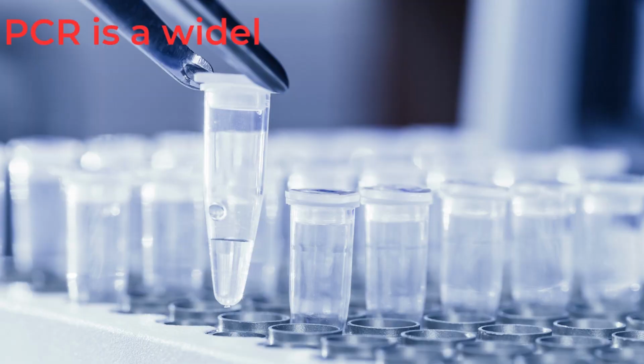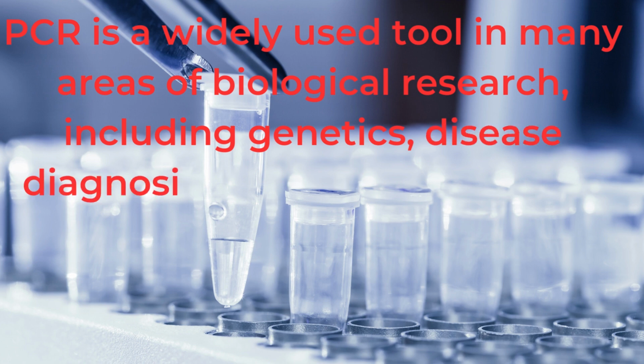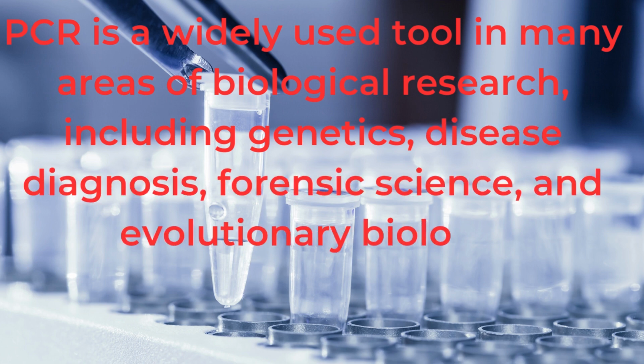PCR is a widely used tool in many areas of biological research, including genetics, disease diagnosis, forensic science, and evolutionary biology.